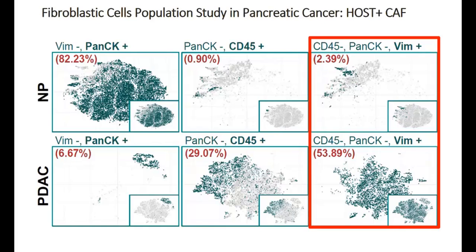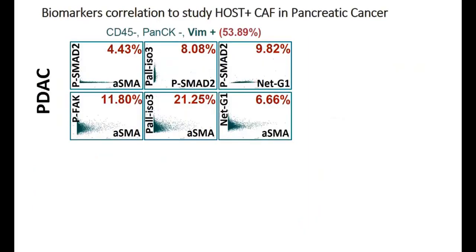Well, focus on this fibroblastic population. We went to check for the presence of the markers that I just mentioned at the beginning of the talk. And to our surprise, I started to check the co-expression of all these several markers to understand better which are the markers that are more relevant.